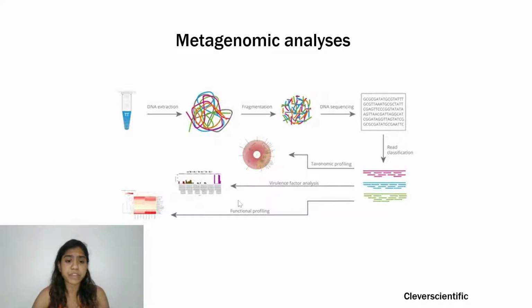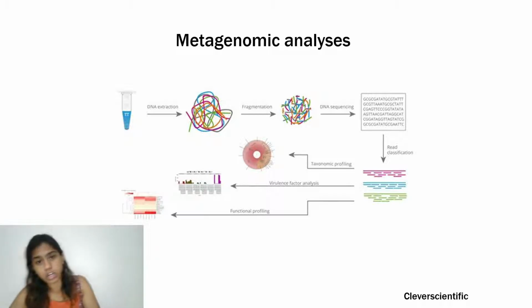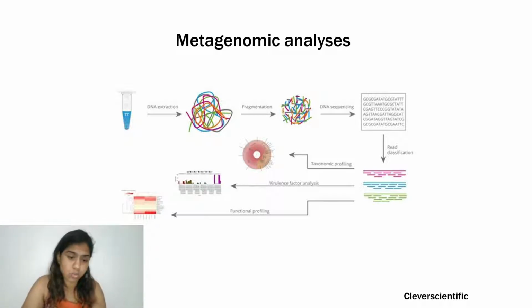the other infection profiles can be assessed, and also the functional profiling of overall what all genes they possess, what are their metabolic functions and so on. So that kind of profiling can also be done based on the metagenomic sequences that we have.